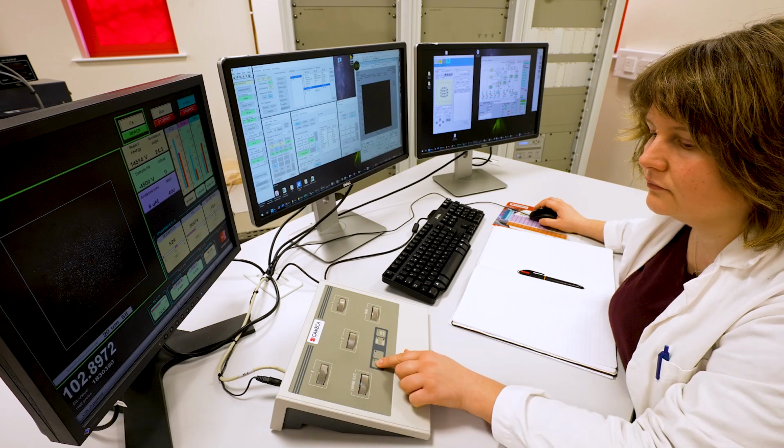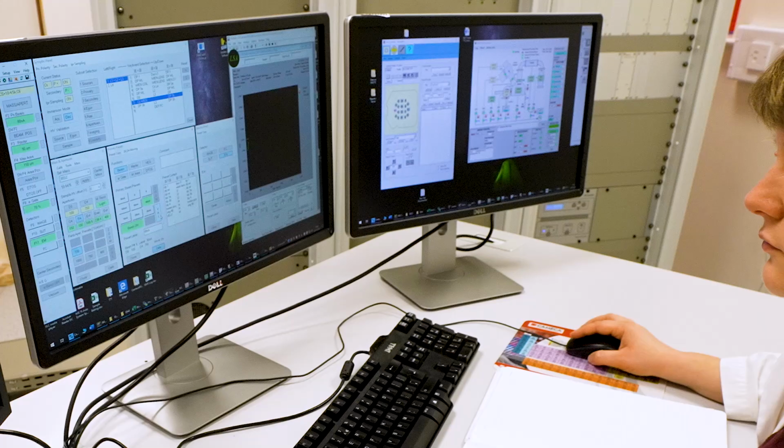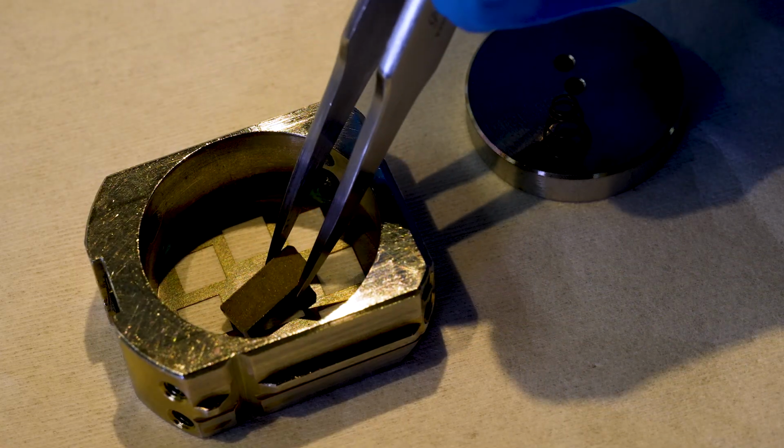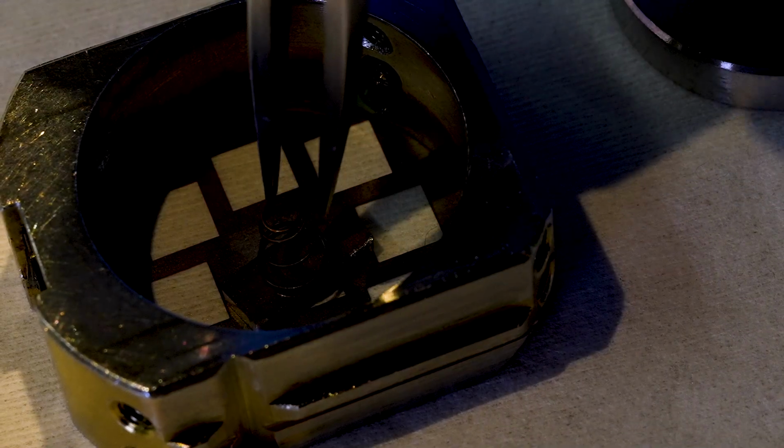So usually within the specimens that we had, we would take a macro section. From that macro section we could get large area maps using a technique we call energy dispersive X-ray spectroscopy, which allows us to map chemical composition across the sample. From that we would find specific features of interest. So for our industrial partners that might be something like a crack tip or a specific feature that they want to analyse. Then we can take further sections from that using the focused ion beam and then transition to the TEM, where we can again do energy dispersive X-ray spectroscopy. And it was in this system that we were able to find corrosive species on simulation samples.